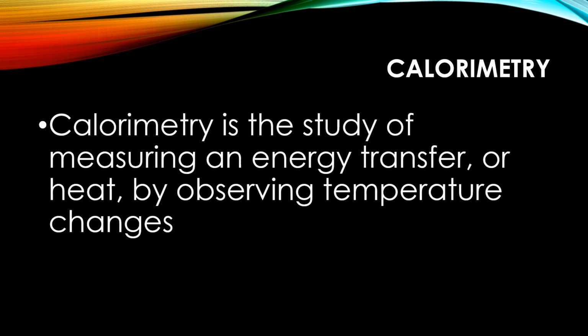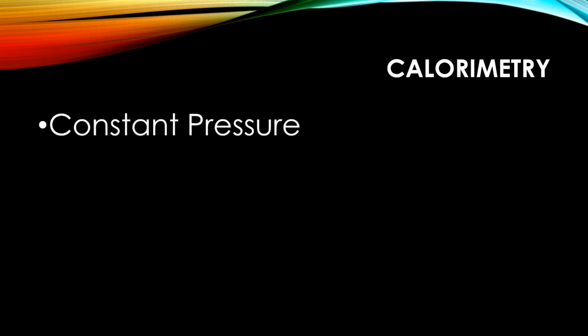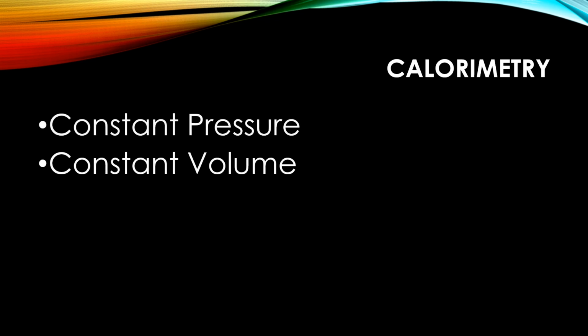Calorimetry is the study of measuring an energy transfer, or heat, by observing temperature changes. There are two conditions that we'll see in general chemistry: constant pressure and constant volume. In this lab, we'll work at atmospheric pressure, thus constant pressure.